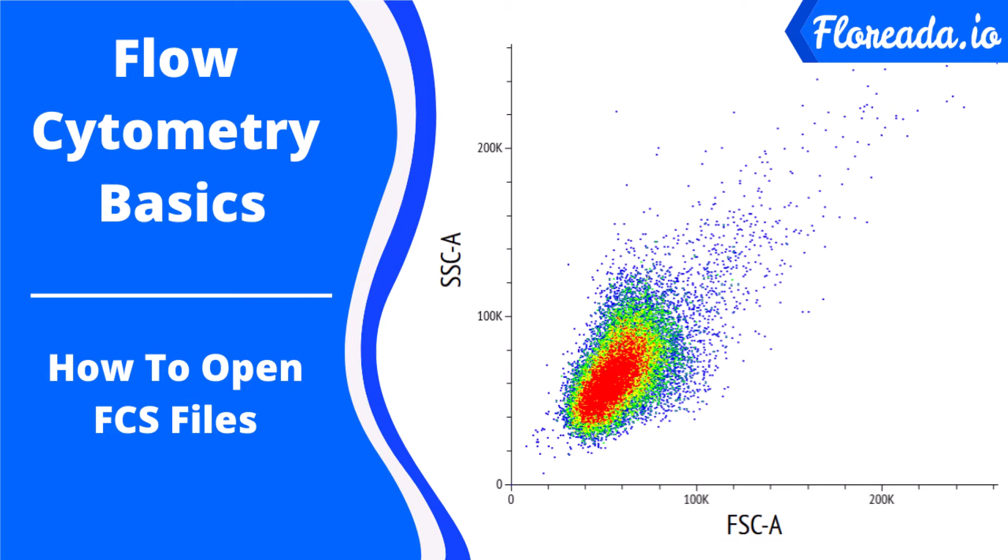Hello everyone, this is Curtis from Flowrida.io and today I'm going to talk to you about how to get started working with FCS flow cytometry files.